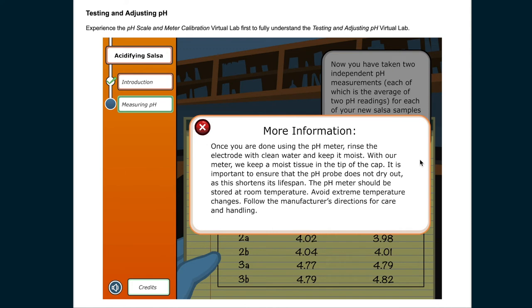Once you are done using the pH meter, rinse the electrode with clean water and keep it moist. With our meter, we keep a moist tissue in the tip of the cap. It's important to ensure that the pH probe does not dry out, as this shortens its lifespan. The pH meter should be stored at room temperature. Avoid extreme temperature changes. Follow the manufacturer's directions for care and handling.